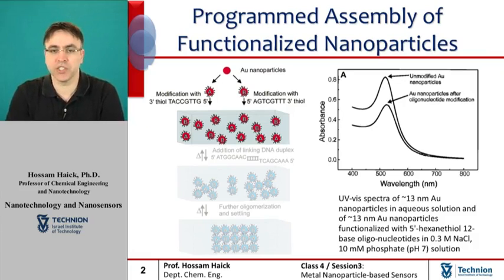One way to monitor changes in a solution of nanoparticles is by monitoring the changes in the optical properties of the solution. In the presented example, the changes in the absorption of the solution are examined. This system is designed in order to detect the presence of a specific DNA. For that purpose, the nanoparticles are modified through a thiol bond with a single-stranded DNA that is complementary to the targeted DNA.